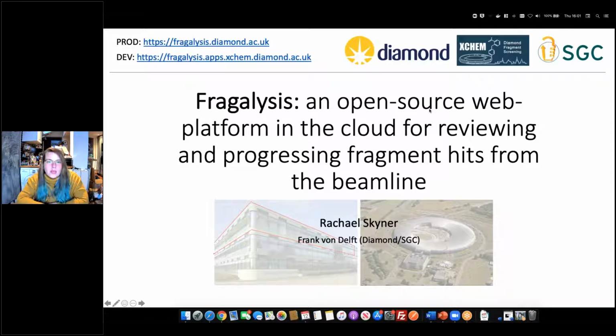I'll talk a bit more about the science behind what we do and how we do it before I dive into Fragalysis. So Fragalysis is developed across 2 organizations, Diamond and the SGC, and also involves a lot of contributors across the world. We have separate developers in Slovakia for the front end stuff. We work with some informatics companies as well. And we work very, very closely with Janssen Pharmaceuticals. They've actually funded a lot of this work, so that's just an upfront acknowledgement of that.